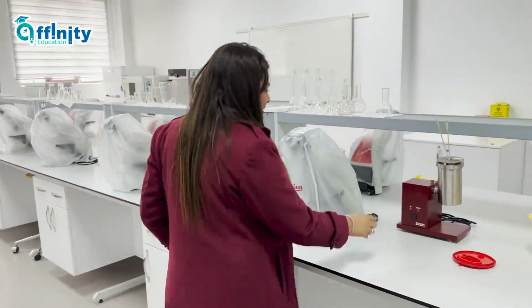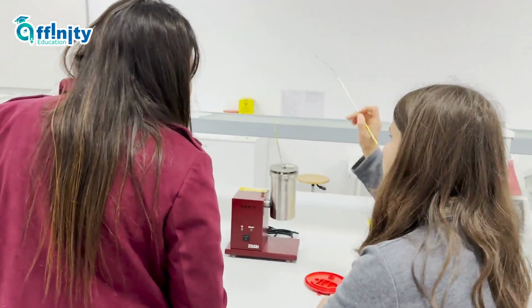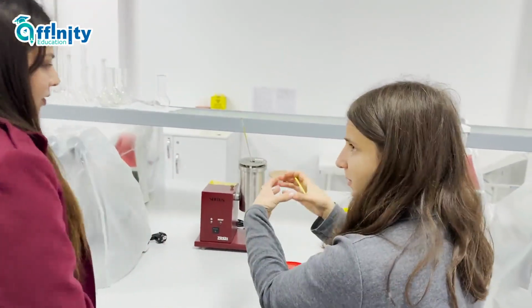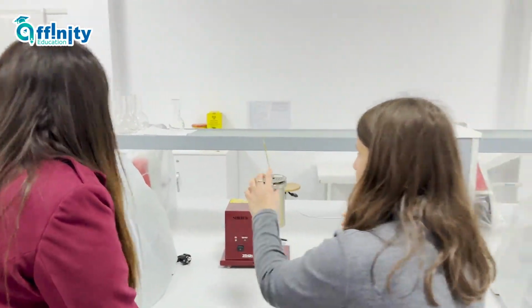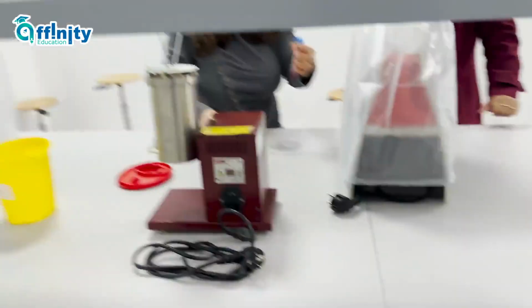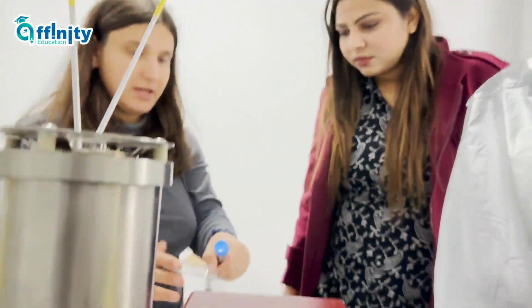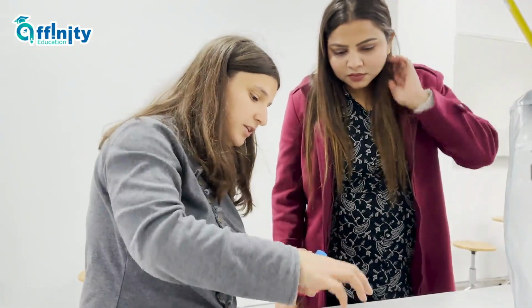Okay, and what is this? This is, you see, this is for microbes. As I showed you, these are the petri dishes. You remember these petri dishes? For example, we have microbes. These microbes need food. Medium is food for them. That's why we prepare a medium from this kind of tube. We put this medium here.